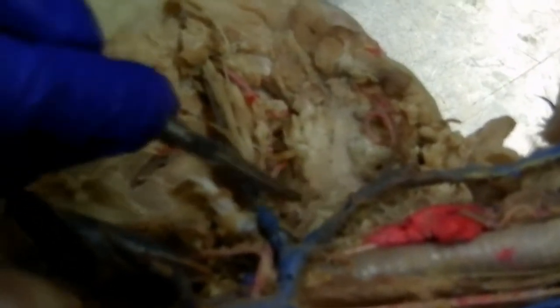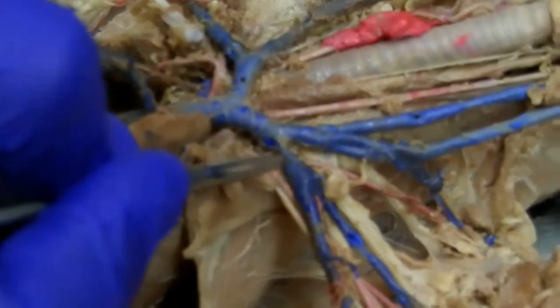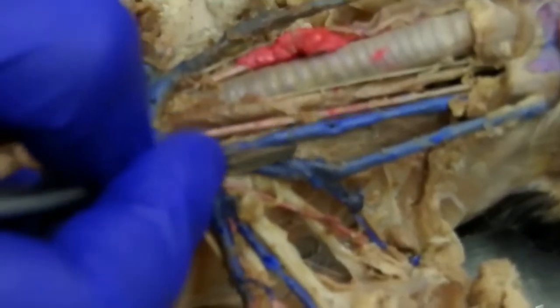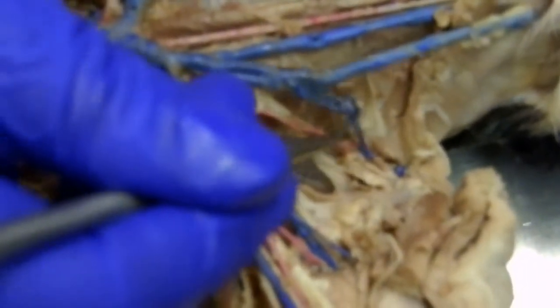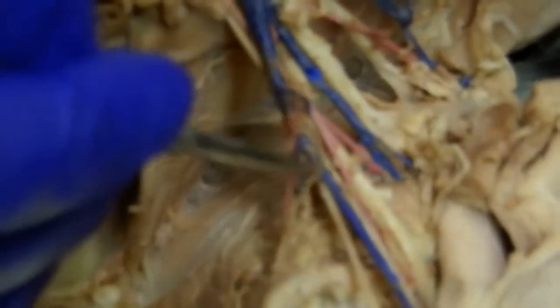Following over here, this is axillary, and then that is your subscapular — that's all we can really see over here. Following this way: here's your brachiocephalic, subclavian, jugular. Following the jugular up — this is external jugular, this is the internal jugular. This is the only one that got injected on that side — internal jugular, external jugular over here. Off the external jugular you see that transverse scapular. Follow the subclavian out — this is axillary after the branch, this is subscapular. We follow axillary to here and now we're into brachial.